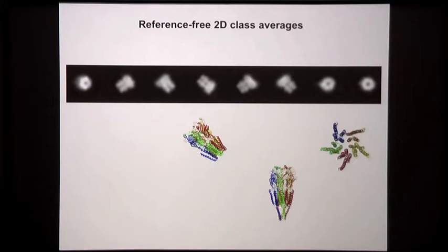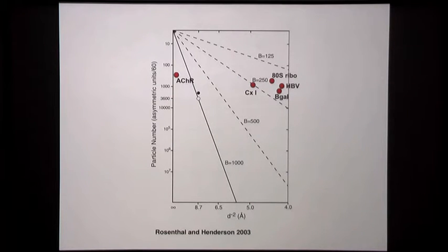One interesting thing is that this part which Nigel modeled, the alpha helix on the cytoplasmic domain, is lost when you treat with detergent. Which means that you have only this part here, and which I think is one of the reasons why I have an accuracy of about 8 degrees and the resolution is stuck around 16. So if we plot the acetylcholine receptor in this graph here, I've used only about 8,000 receptor molecules. It's about 16 angstrom, and a B factor maybe around 2,000.